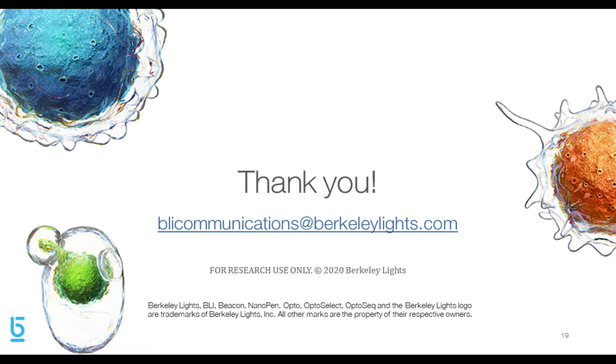Okay, your first question here is, can B cell discovery on the Beacon system screen human patient samples? Yes, so the Opto B cell discovery platform will work with both human B cell samples as well as mouse B cell samples. And it's compatible with fresh plasma B cells as well as activated memory B cells.